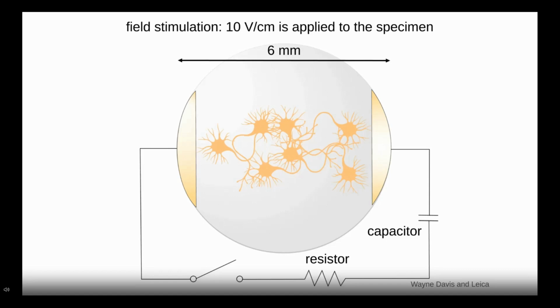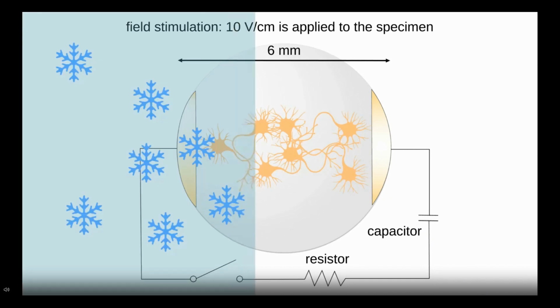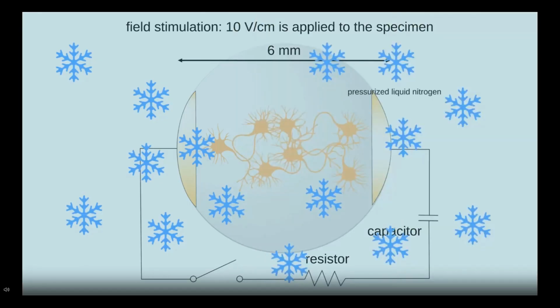And then once in there, everything works just like it does in flash and freeze, except now your light shines onto that photoelectric cell, that closes the circuit, and then you just shine the light for a millisecond, boom, those cells get zapped for a millisecond. And then just like with flash and freeze, you can freeze your cells at whatever time point you want, 5 milliseconds, a second, 10 seconds, whatever you like. And so yeah, we call this zap and freeze.